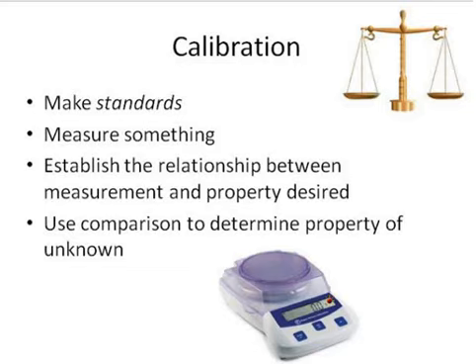But I should point out that this calibration procedure, which uses known masses, has to be performed every once in a while. So every couple of years we pack up all of our balances and send them off to the factory, or have somebody come in and actually put known weights on them and recalibrate them and adjust them if necessary. So this electronic display has a built-in feature that allows you to change that calibration if necessary, if it changes over time.